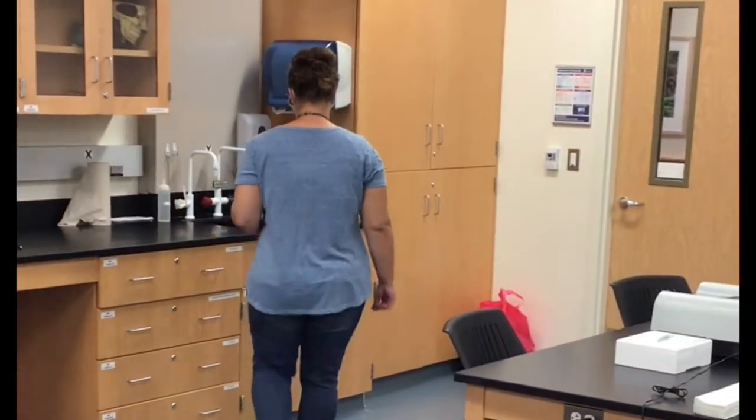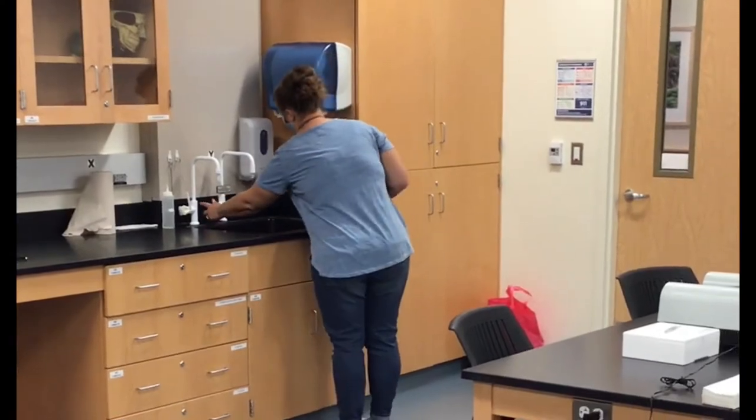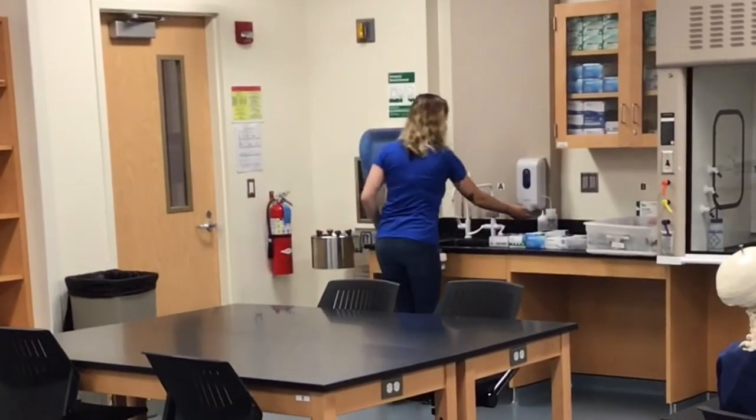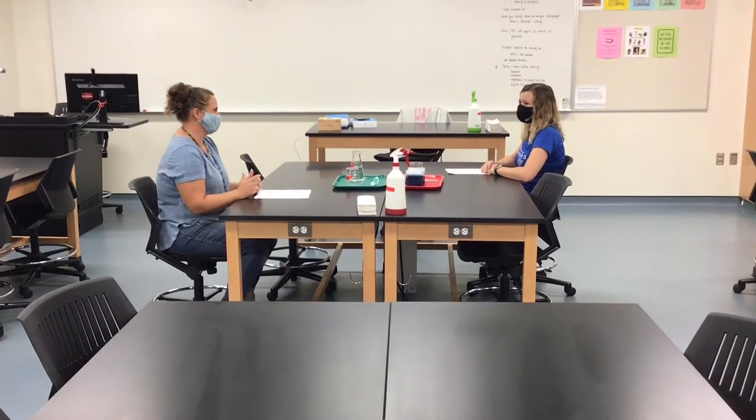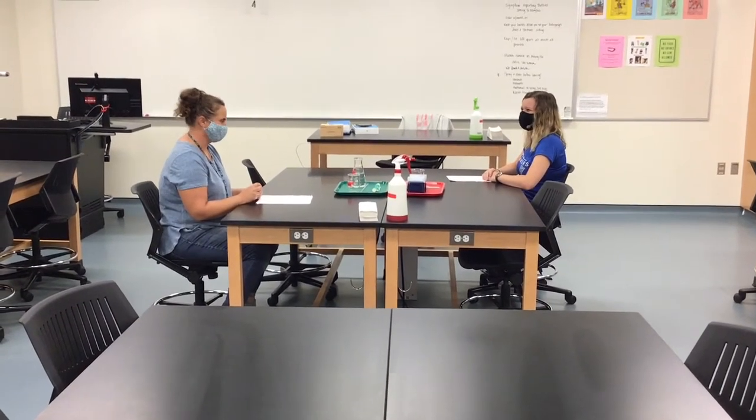After you've set down all of your belongings and taken items out of your bag for the day, wash your hands. Make sure you do this before you sit down at your table. Once you've washed your hands and you're seated, you're ready to start lab.